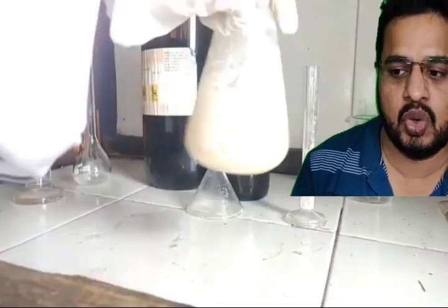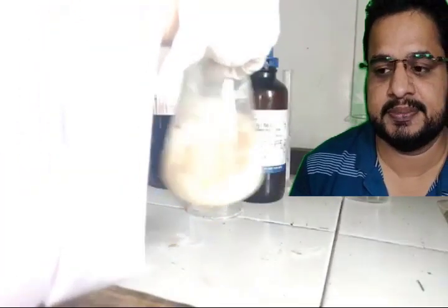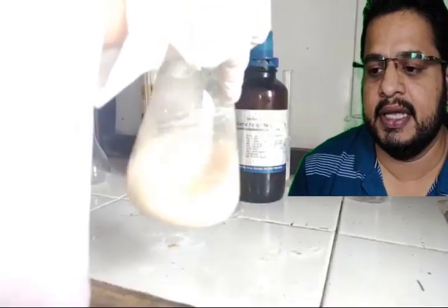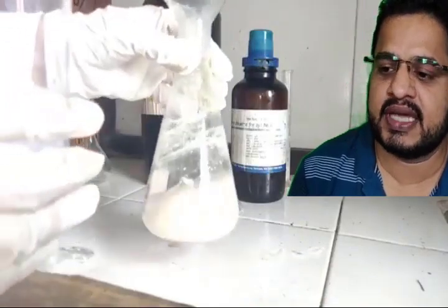See, there are no fumes of benzoyl chloride now. That means almost the reaction is done. Now we will stop the shaking, and after completion of this shaking, I'll add cold water to the solution in this iodometric flask like this. Again shake for a few seconds.